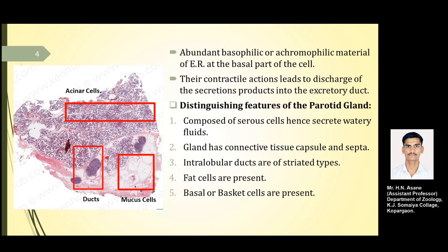The serous cells show fine intracellular and intercellular secretory canaliculi. There is abundant basophilic and chromophilic material of the endoplasmic reticulum at the basal part of the cells. These regions give a striated appearance due to the parallel arrangement of rod-shaped mitochondria and the configuration of the endoplasmic reticulum.